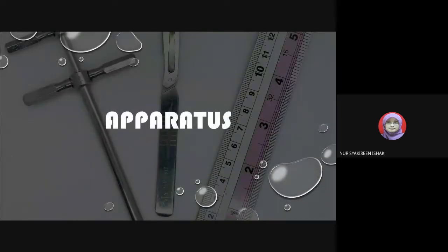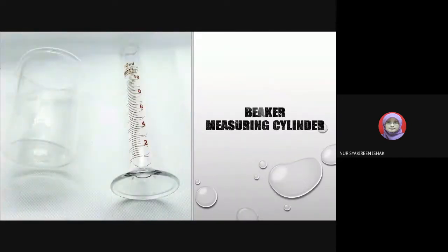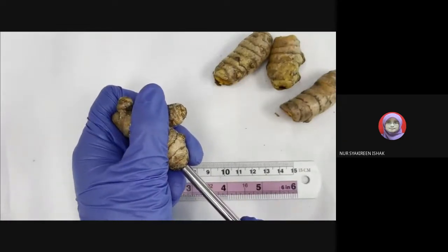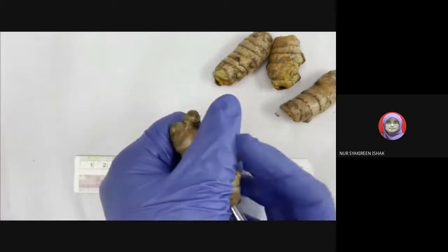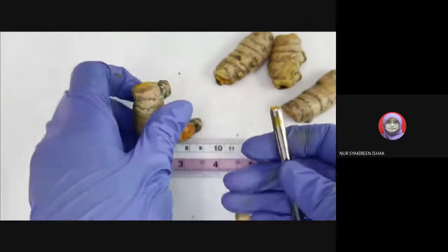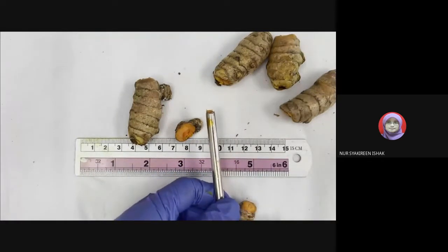Now, let's take a look at the apparatus needed. We need cork borer, scalpel, ruler, forceps, beaker, and measuring cylinder, not to forget a white tile. Use a cork borer to cut 6 cylinders of fresh Curcuma longa tissue. Hold the turmeric with your left hand tightly, and by applying force, I mean a lot of it, start the process by pushing down the cork borer through the tube. Take out the borer and then use the solid pin to remove the fresh cylinder tissue out of the borer.